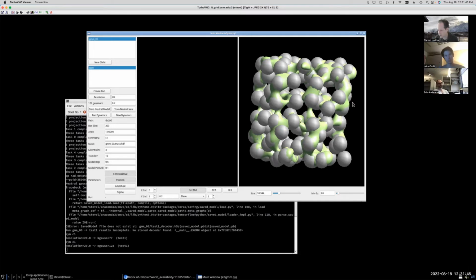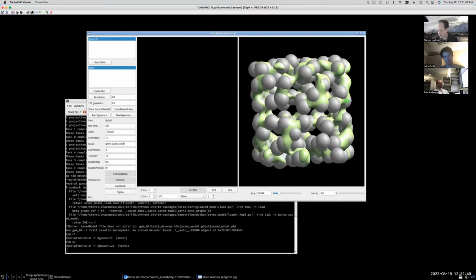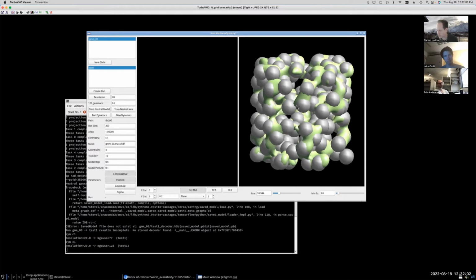It'll probably be a little more pronounced than usual since we've done such an artificial example here, where we've made really smooth continuous motion and we've taken a really big chunk and put it in. Anyway, we'll have to see what happens when we run it. I don't have super high hopes that we're going to be able to see the motion easily.